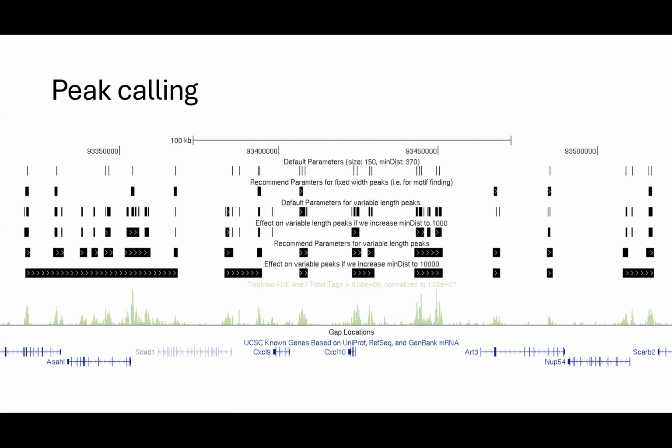You can say it's a histone. You expect, yes, histone peaks, definitely. Homer has different methods for different targets, so it will take into account what it typically sees for those sorts of targets.